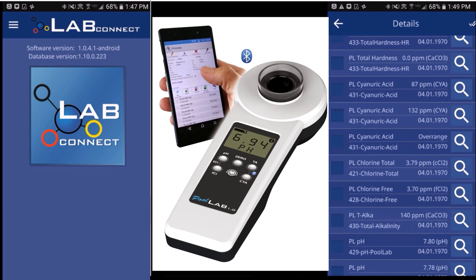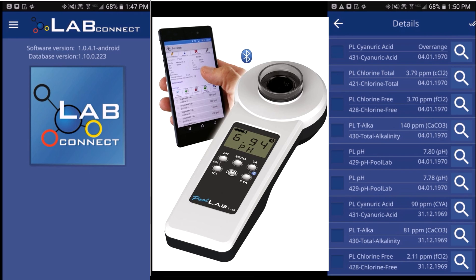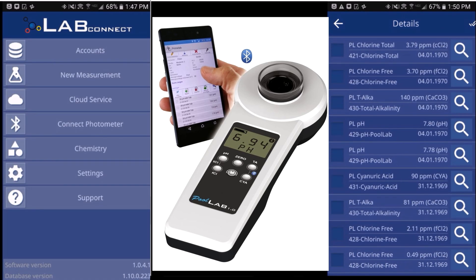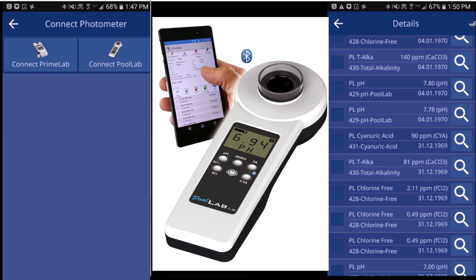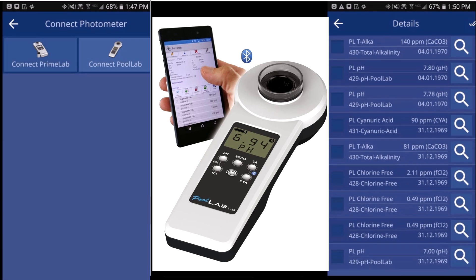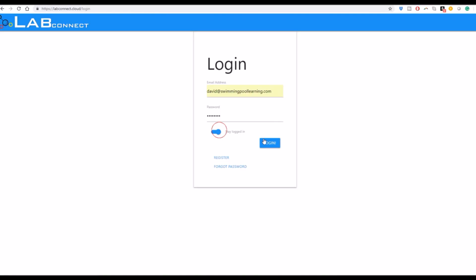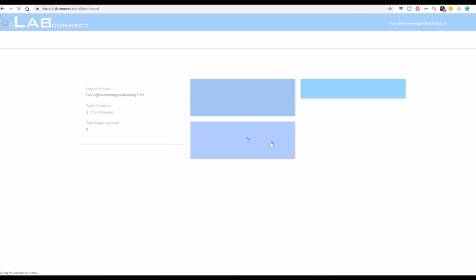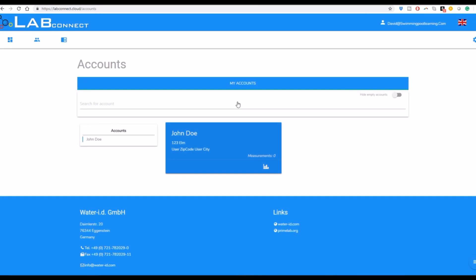The app allows you to easily import all of the readings you took with the PoolLab 1.0. This is a great way to keep records and store all results from your testing. The PoolLab 1.0 holds up to 250 readings and you can transfer them to the LabConnect app very easily. There's also a cloud-based portion where you can send information to view on your PC or another device, making it easy to track all customers and readings from their pools.